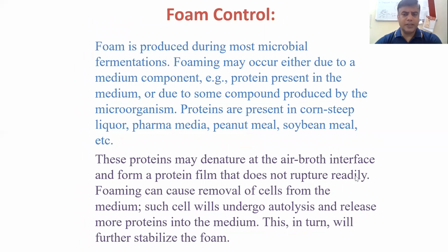There is another sensor or control system, which is foam control. Foam is produced during most microbial fermentations. Foaming may occur either due to a medium component, for example protein present in the medium, or due to some compound produced by the microorganisms. Proteins are present in corn steep liquor, pharma media, peanut meal, soybean meal, etc. So they may cause foaming in the media.